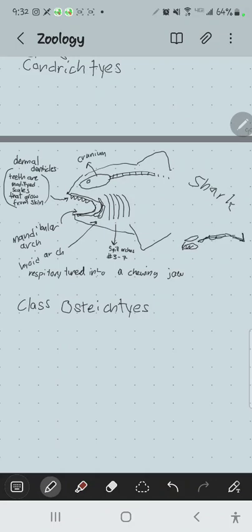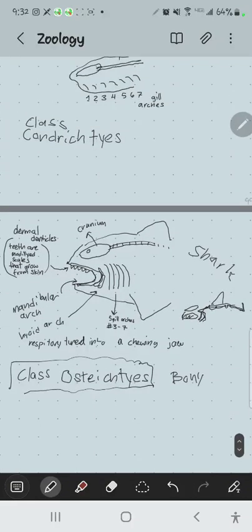You're going to see that when you cut through the side of the shark. You're not cutting through any ribs at all. It's all basically just backbone once you get behind the pectoral fins. Whereas with the bony fish, there is a more elaborate skeleton that includes processes off of the vertebral column, which amount to ribs and dorsal processes, etc. So the skeleton basically is a lot more elaborate.